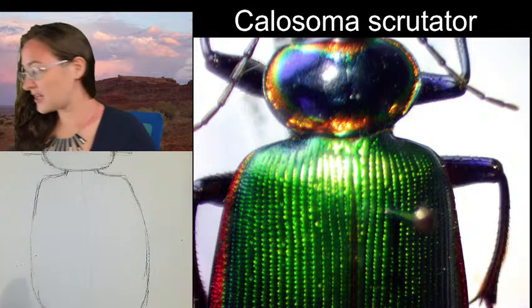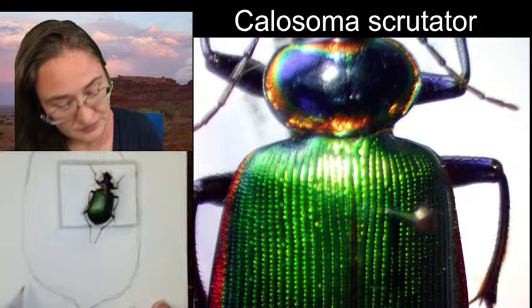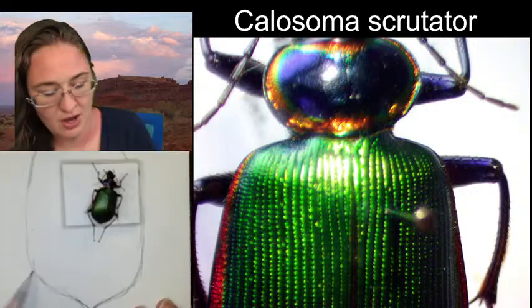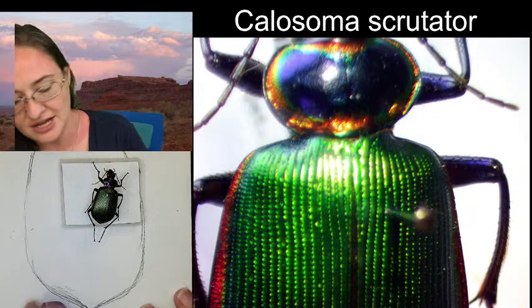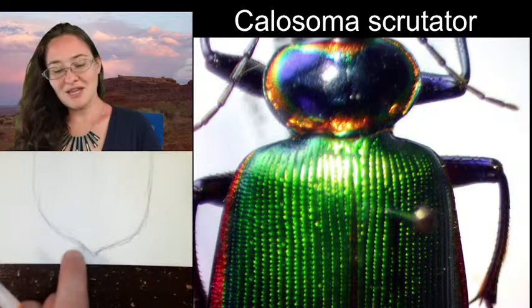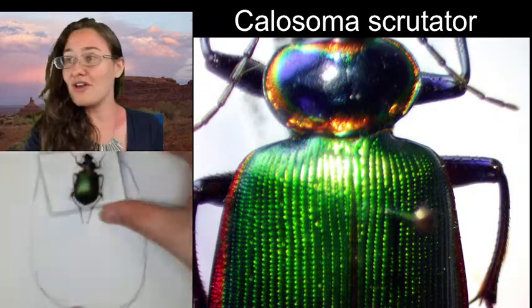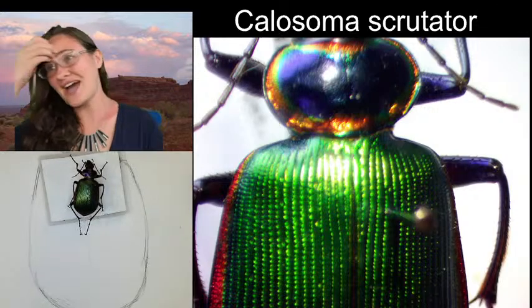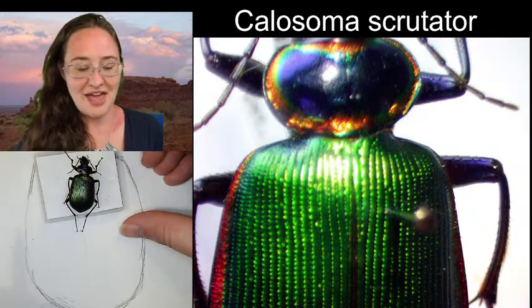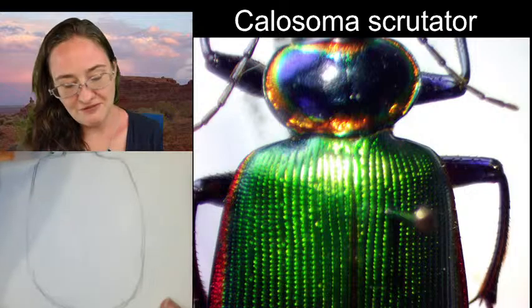All right, I'll pull our buddy over to give us an idea. And this is just our overall sketch. We're going to be going back and zooming in and making sure all these lines are right. But it also makes sure that my specimen is not going to be going off of the paper. Although, if I do sketch the legs the way that this guy is holding his legs, then I am going to go over the paper. So we're going to finagle that a little bit and move the legs to make sure that they fit on my paper.